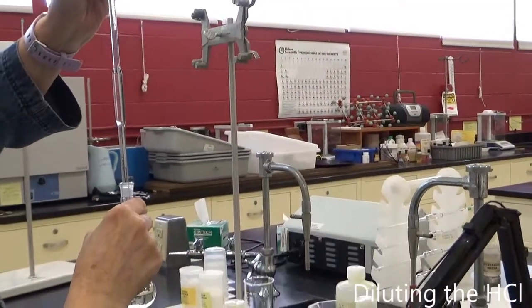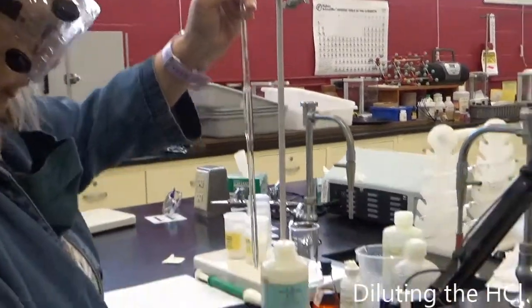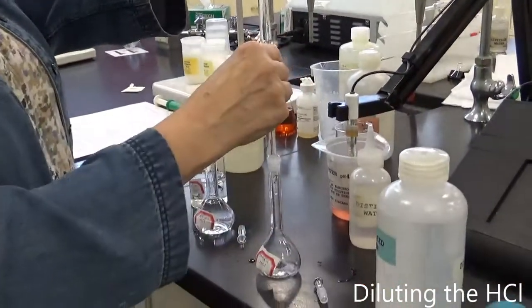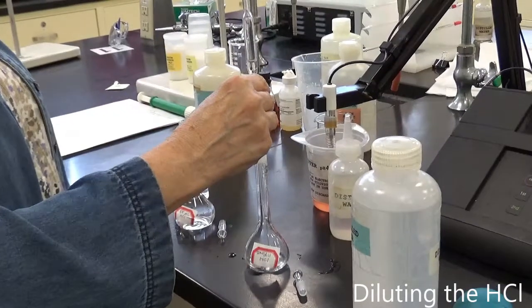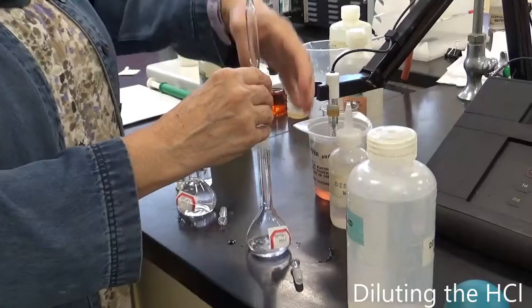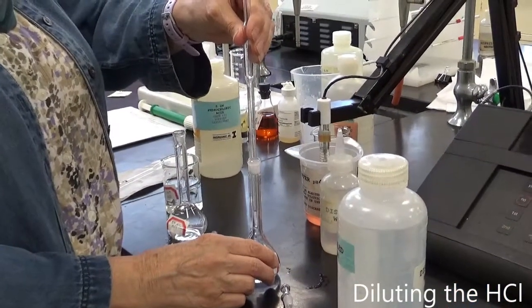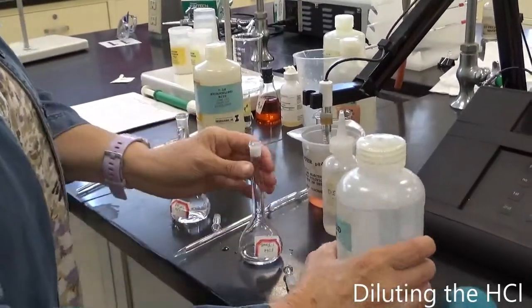These pipettes are what we call to deliver, which means we let all of the liquid in them flow out. If there's a hanging drop, we leave it. That's the way the pipette is calibrated. I'm just going to leave it. Now I take it out. Okay? Now again, I'm going to dilute this with water.